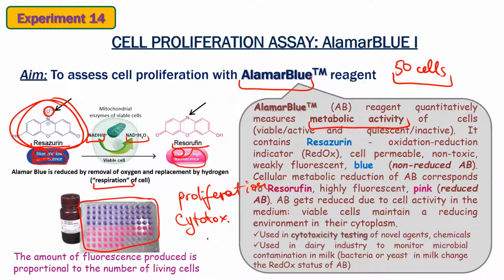And finally, because this process of cell breathing is related to any cell type, we could use it to determine if we have some kind of contamination in liquids that should not contain bacteria and yeast, or should contain them only in very low amounts.